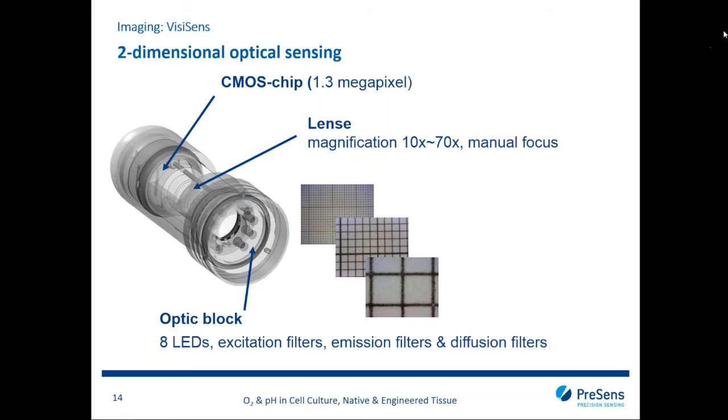Robert, maybe I can just step in here for a second. We have already questions. Maybe also one remark again to the audience. At any time, you're welcome to send us your questions via the webinar tool. And there is already one question that fits to this chart, and this question is about the spatial resolution of the system, and whether it's possible here to measure in microscale. Maybe you can give us some numbers there.